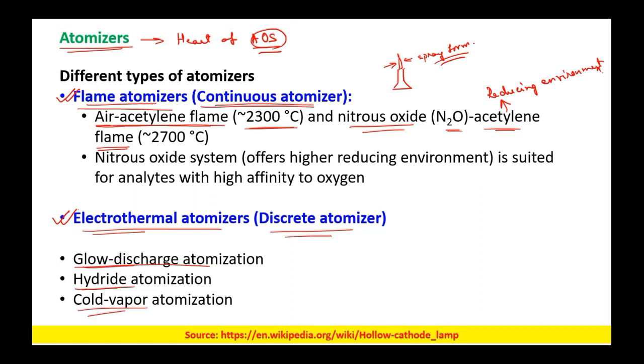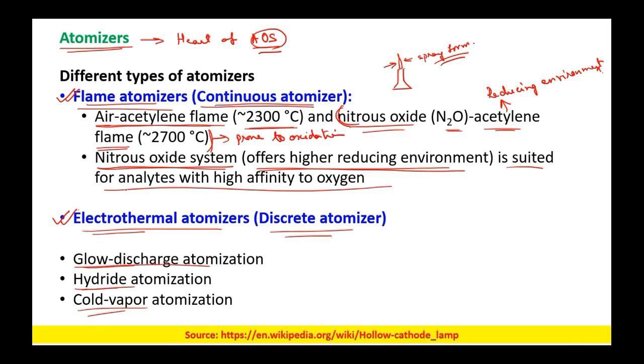Okay, so if there are any samples which are prone to oxidation, then this nitrous oxide acetylene flame can be used for the analysis. Okay, if you see, the nitrous oxide system offers a higher reducing environment and is suited for analytes with high affinity to oxygen.